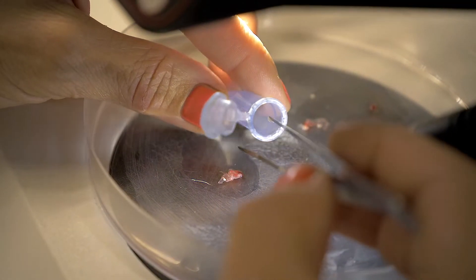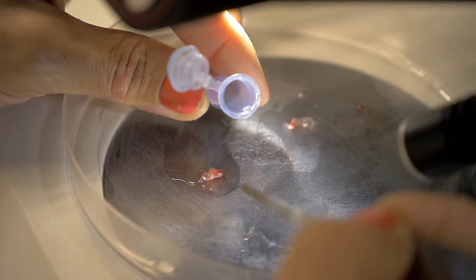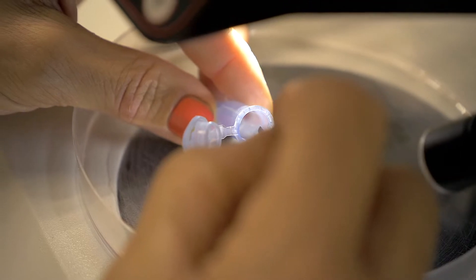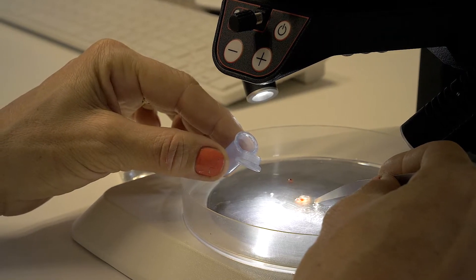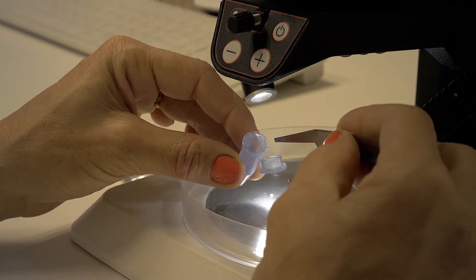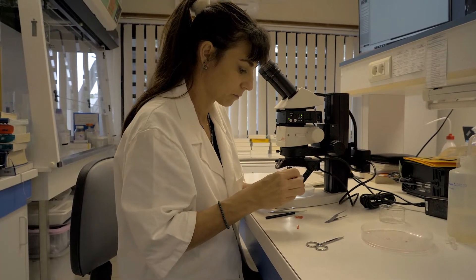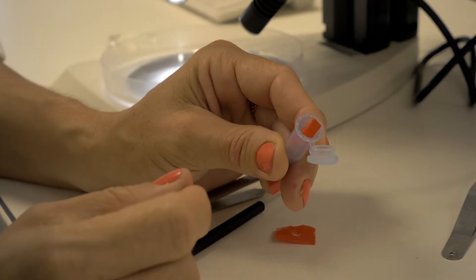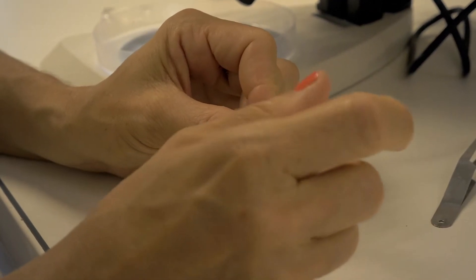I'm using very soft tweezers to grab the otoliths and I place the otoliths inside the vial very carefully. When you finish placing the otoliths, don't forget to add the label inside the vial. Use a soft label so as not to damage the otoliths inside the vial. Close the vial making sure it is tightly sealed.